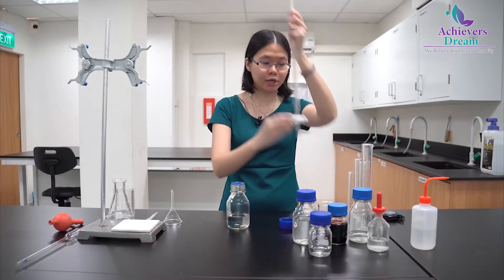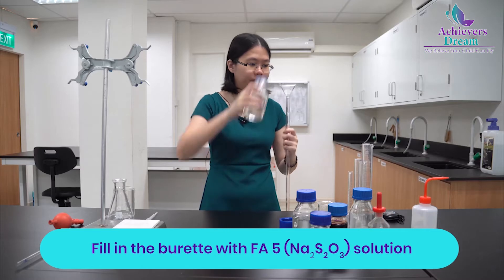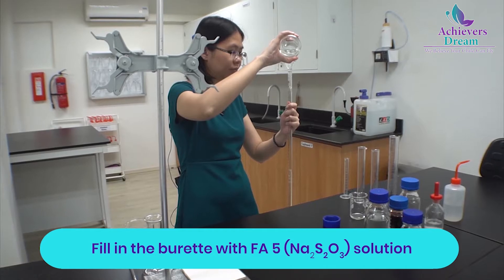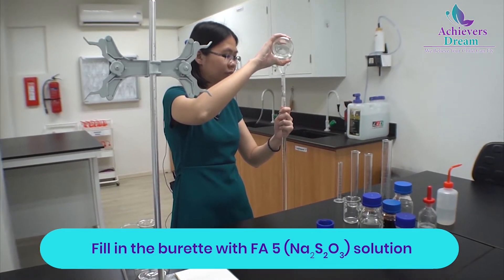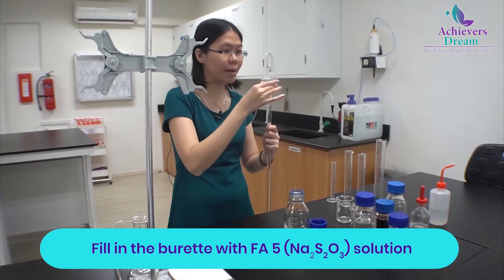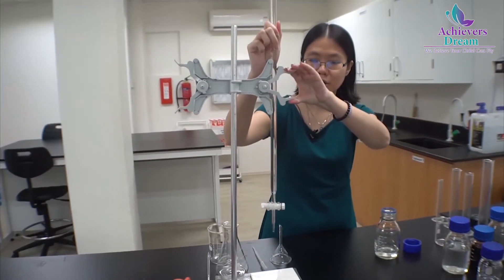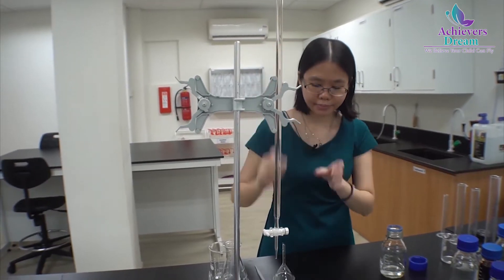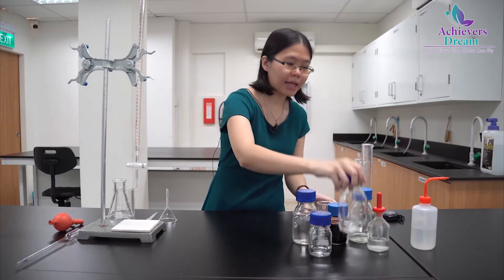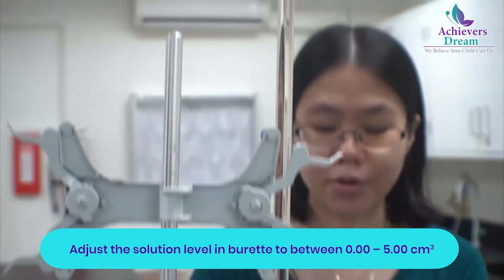Make sure that your burette is closed and fill the burette with your FA5 solution. Remember to remove your filter funnel and clamp it to the retort stand. Then adjust the liquid level inside your burette so that you can get a proper reading.